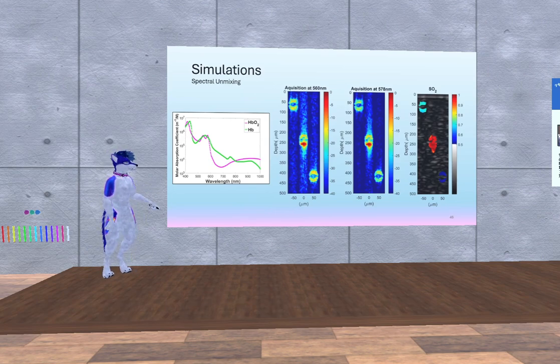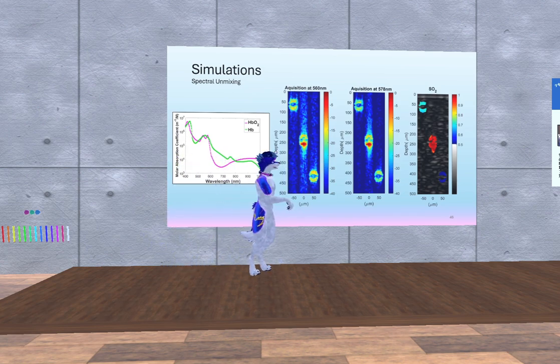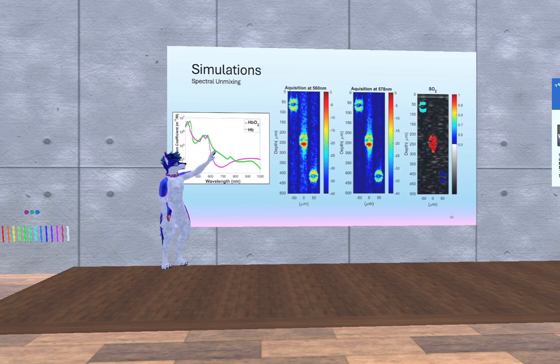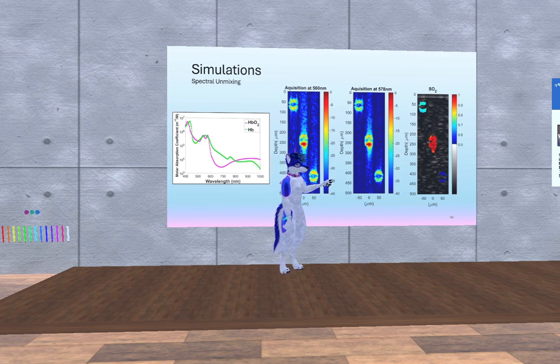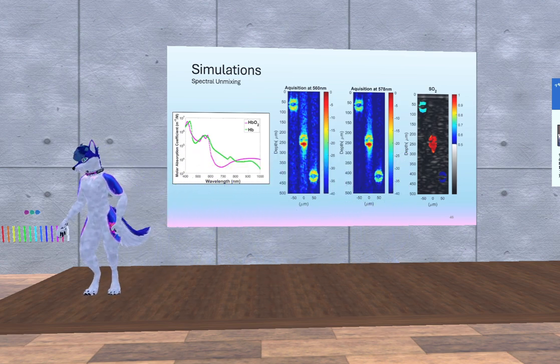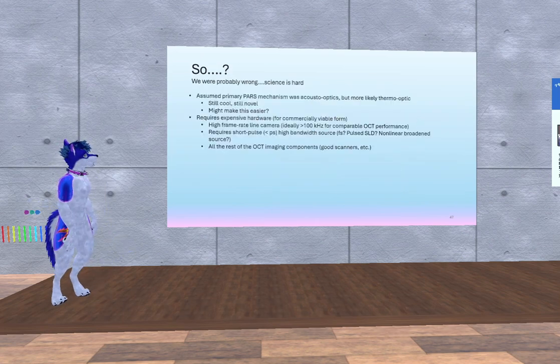So hey, does this seem like it's sensitive enough to pick up these small differences? Yeah, sure. And again, it's going to be another game of dynamic range. It's a game of dynamic range, squared. You can see the two individual exposures, and all we're doing here is exposing two different excitation wavelengths. So imagine we're trying to target one spot here, where the difference between the two chromophores is appreciable, right? And then you run this through just a simple linear system, and you can solve what the local oxygenation would be. So really cool.